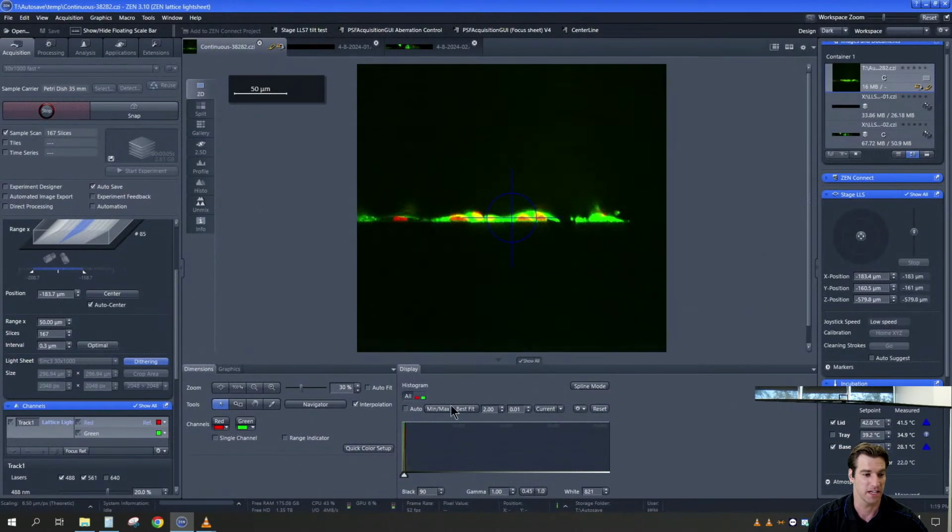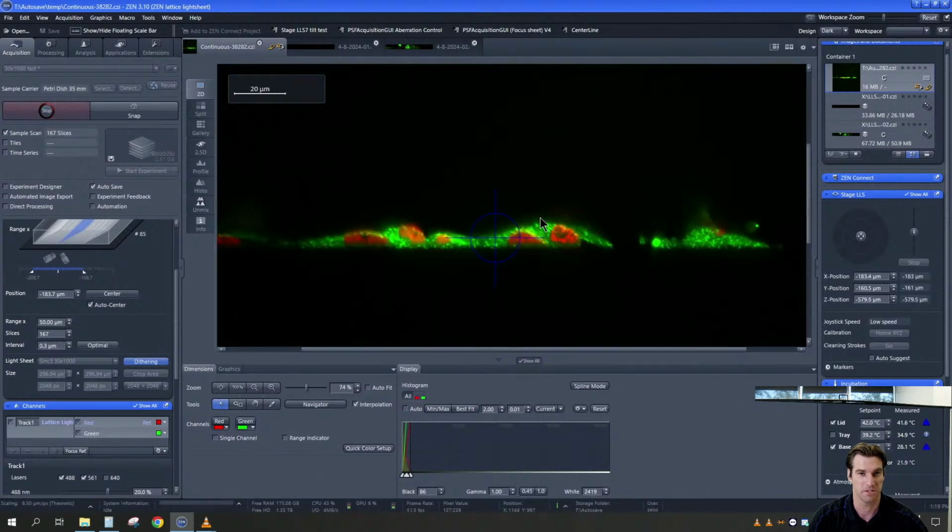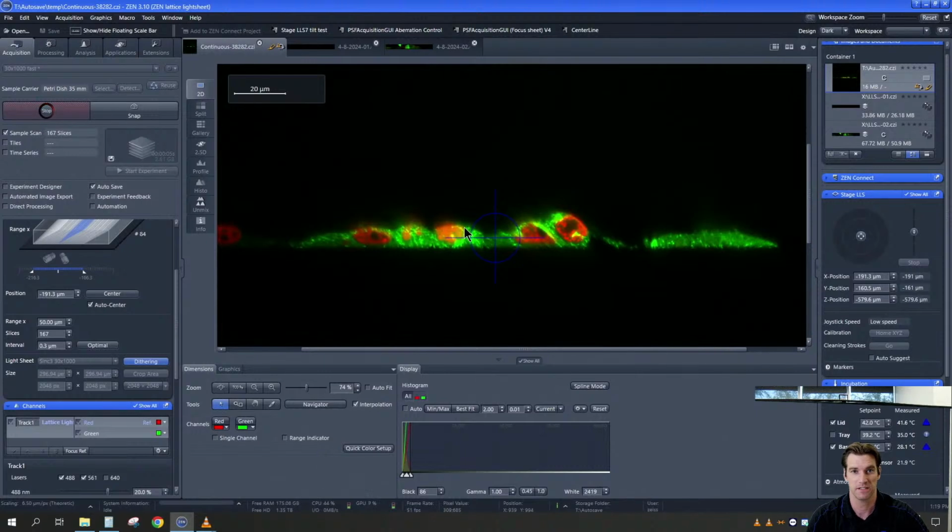And as you mentioned in that expansion microscopy example, that was really useful, because for anybody who's ever imaged expansion microscopy on an inverted system, you know that finding that first Z plane is very, very difficult. It's very difficult to define your focal plane.